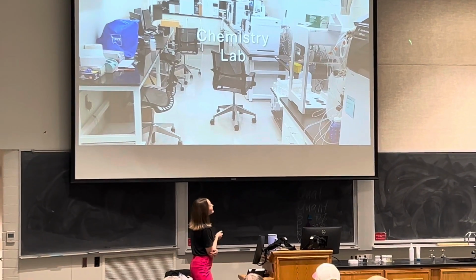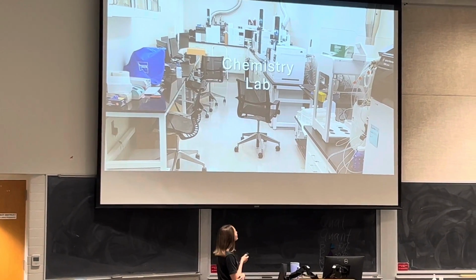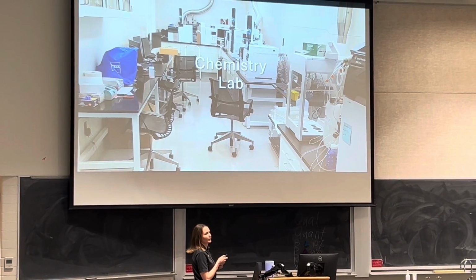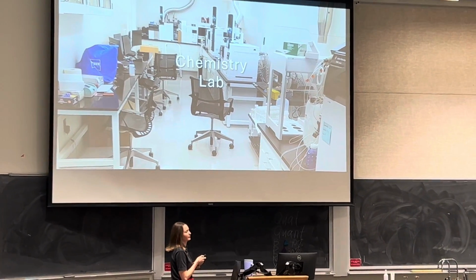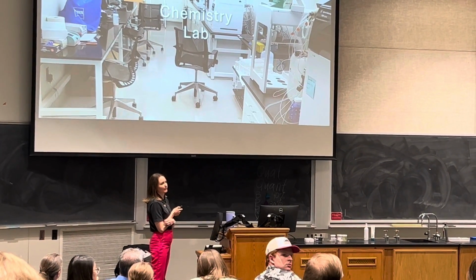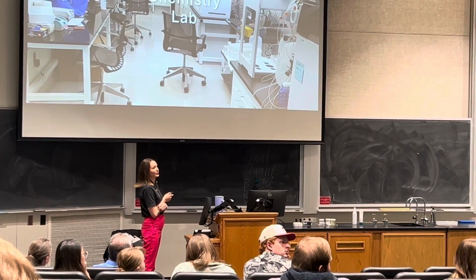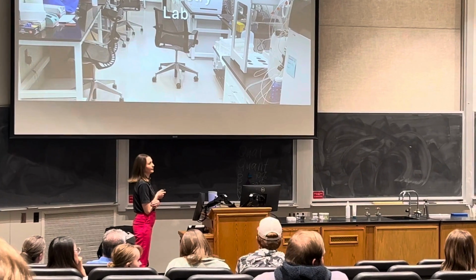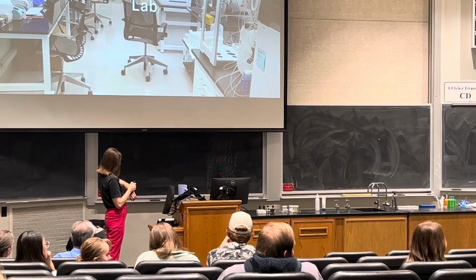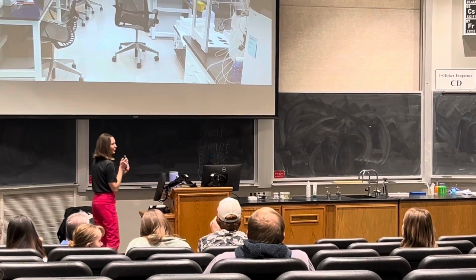And then we have our ICP-MS. Do you want to say anything about that, James? He's our ICP-MS expert. Yeah, so we run heavy metals and minerals on that instrument, and it just uses a plasma to essentially, so you digest your sample completely in a microwave, and then you put it through the instrument, and then the plasma basically burns everything off and just shoots the elements through the detector, and that's how you get the label claim. So when it says like 30 milligrams of potassium in a sample, that's how it's tested. Perfect. That's perfect. Thank you.